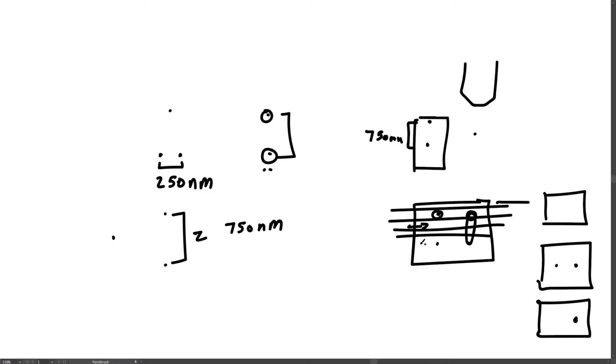And then if you kept sectioning, eventually you would get to another sample that had a dot here and here. And in that way, you could differentiate between these two by mechanically sectioning the tissue and looking at the sections. But anyway, that's the diffraction barrier.